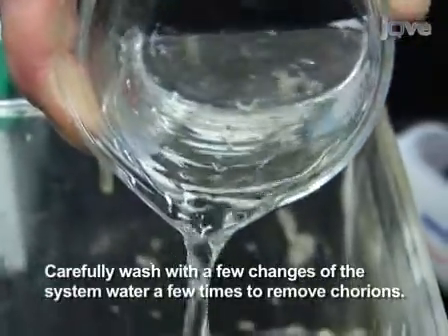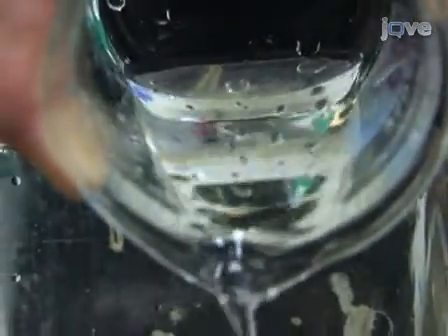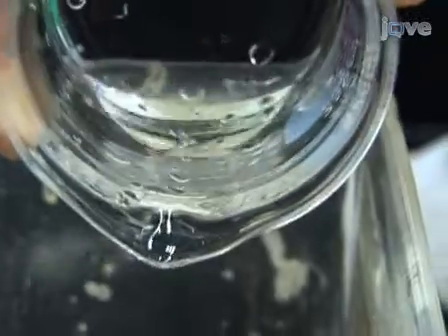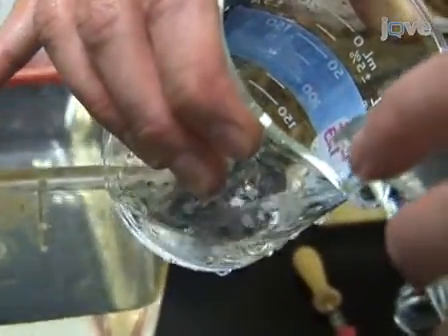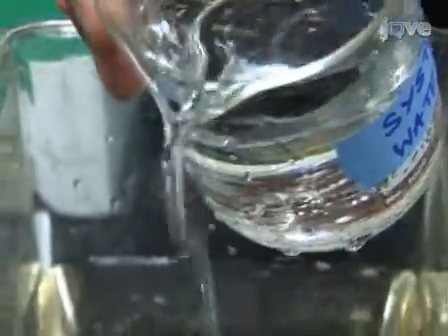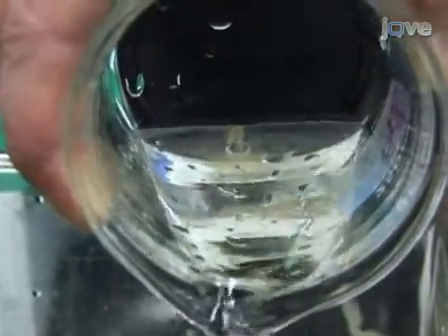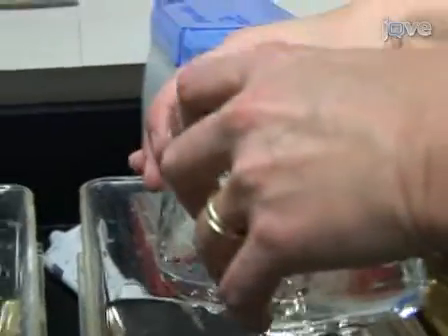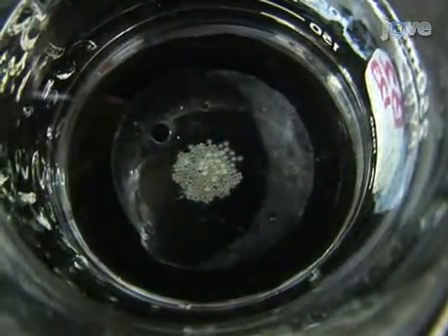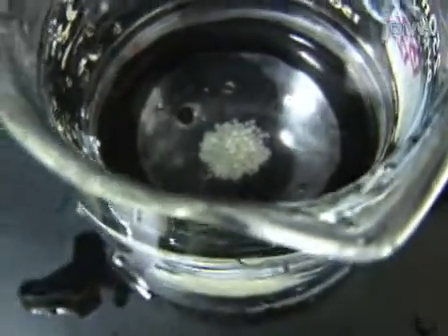And this is pouring off all the chorions, and the embryos are staying down behind at the bottom of the beaker. It's really important that the embryos don't hit the surface of the water. Most of them have their chorions off. There's a few swirling around the outside that don't.